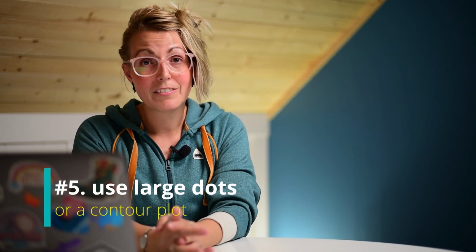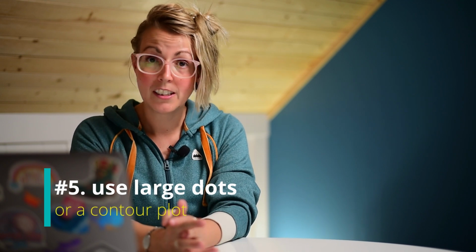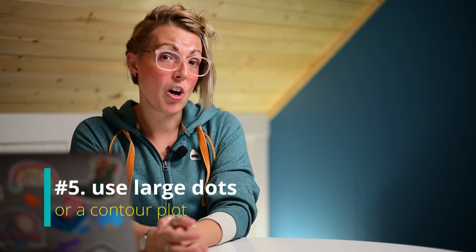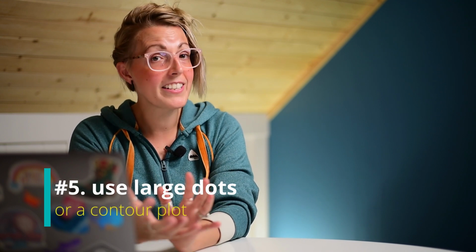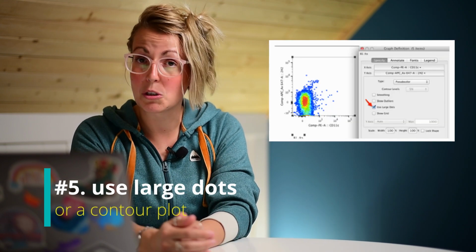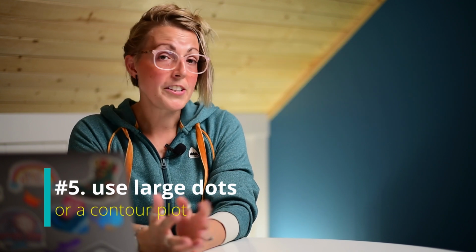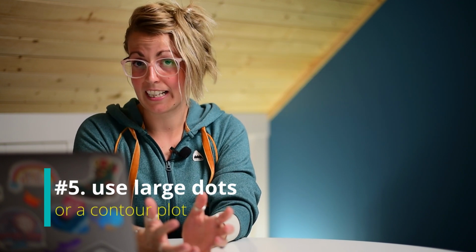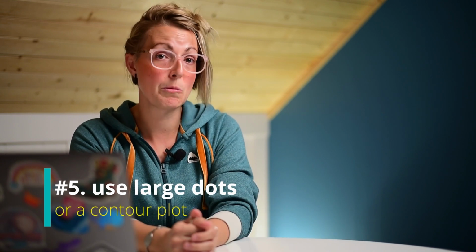Tip number 5, use large dots, or better yet, a contour plot. If you don't have a lot of events on your plot, it can sometimes be hard to see the small dots. If you want to stick with the pseudo color or the dot plots, then I recommend in FlowJo switching these to a larger dot so that they're easier to see. Contour plots though can also really help in this case, so I'd recommend taking a look at both and see which presentation format you prefer.